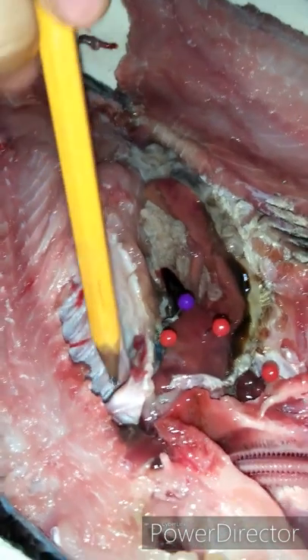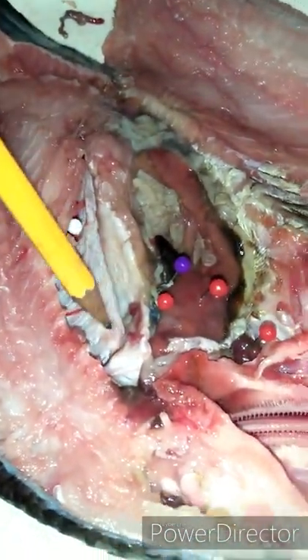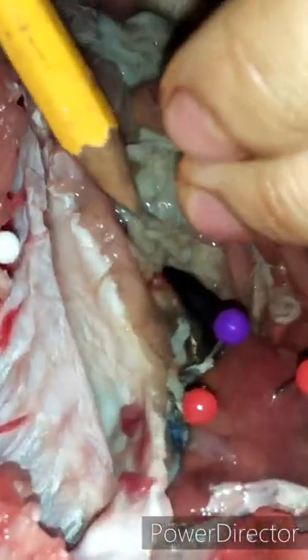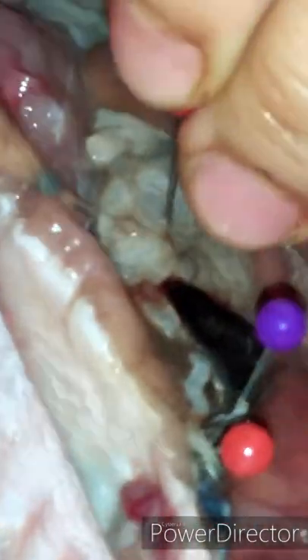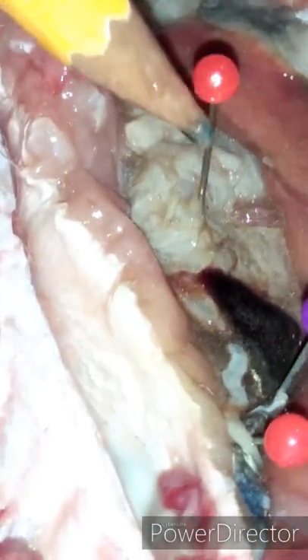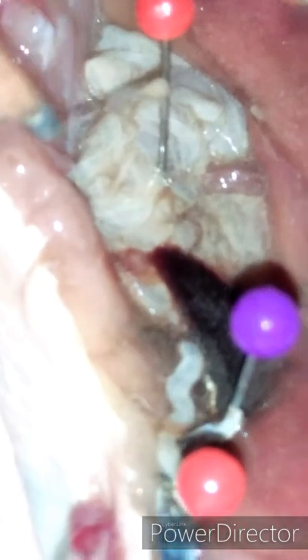After the swim bladder, now we're going to locate the pyloric caeca — it is located here. The pyloric caeca secretes enzymes that aid in digestion and may function to absorb digested food, or do both.